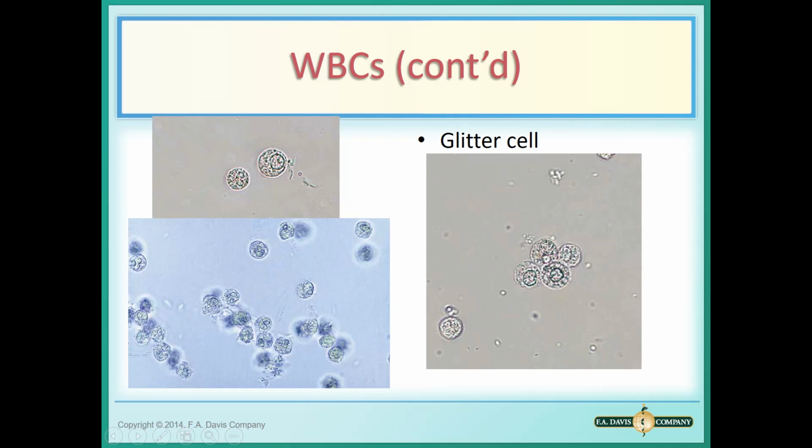This is a single lobed one. So this may be a monocyte. It may be it's really big for it. Frankly, it's very big. I wouldn't consider that it would normally be a lymph, and it's very granular. But you can see there's the nucleus. If you're trying to determine the difference between a white blood cell and a red blood cell, look for the nucleus.